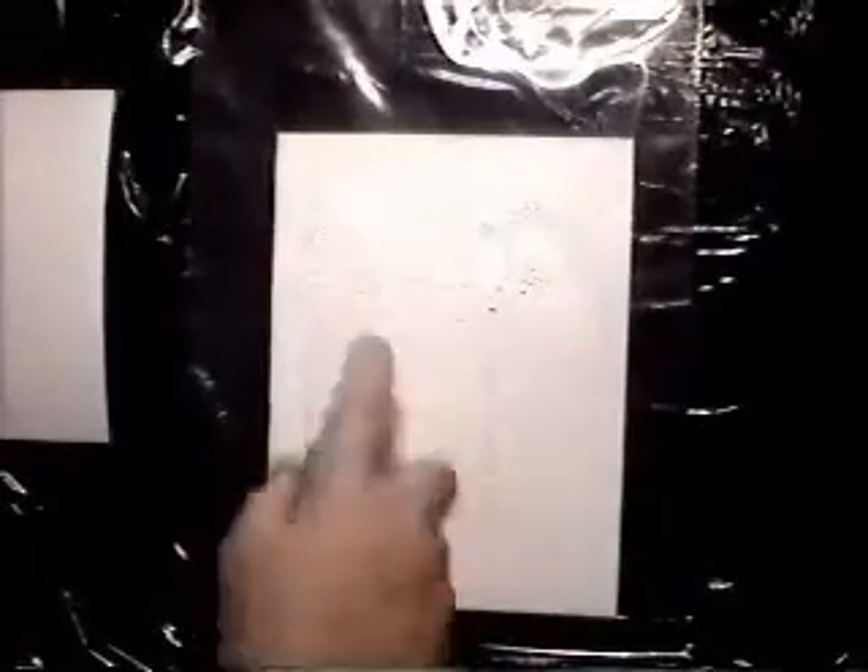What we're going to do now is develop latent prints on this wet surface. To prove that this surface is wet, I am now spraying water on it. I'm going to use wet print inside my oil pump and develop the prints.